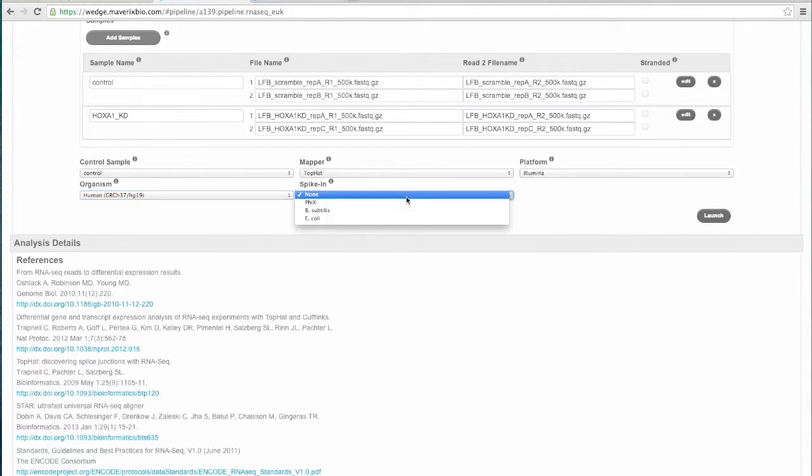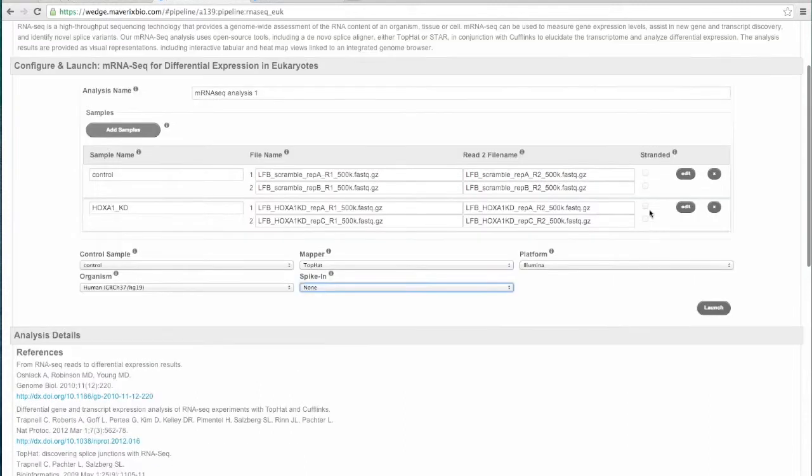And then once you've done that, there's only one final thing you need to pick. For your sequencing run, if a spike in control was used, you would just select that here. So that's it. You would just give this a look over, make sure that you had added all your samples correctly, make sure all your replicates are aligned correctly in terms of the numbers that you picked, and then make sure that these final options here are selected correctly, and then you would click Launch.